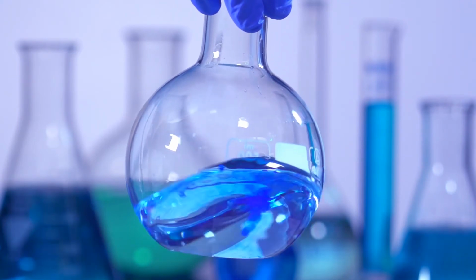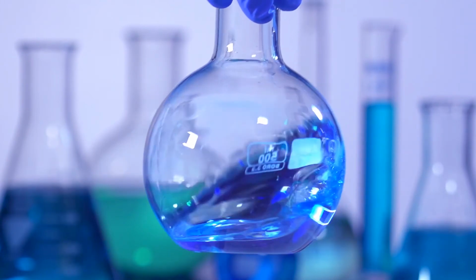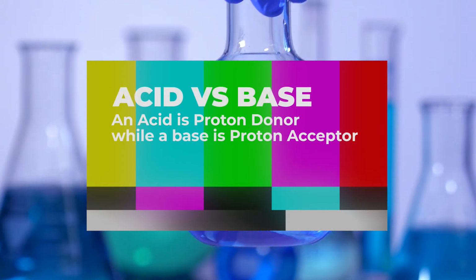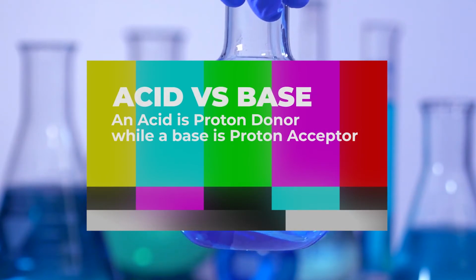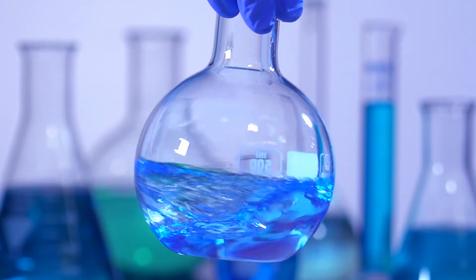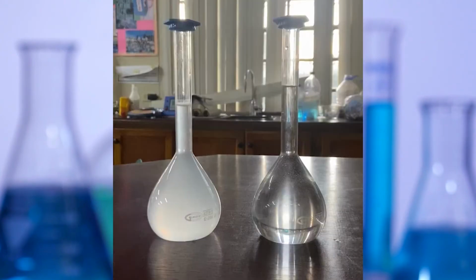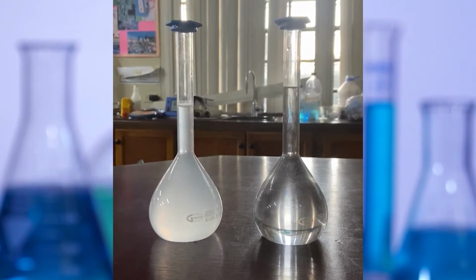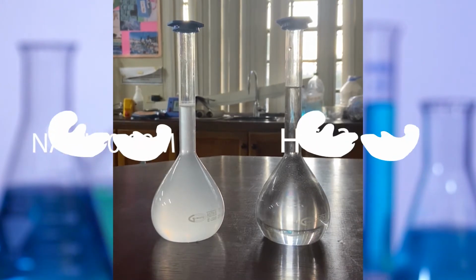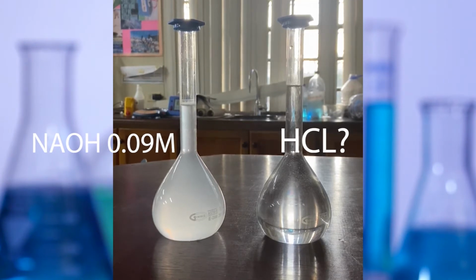In today's experiment, we will be doing an acid-base titration. In simple terms, an acid is a proton donor and a base is a proton acceptor. When an acid and a base react, the reaction is known as a neutralization reaction. We will be using sodium hydroxide of concentration 0.09 mole per dm cube to determine the concentration of a sample of hydrochloric acid.